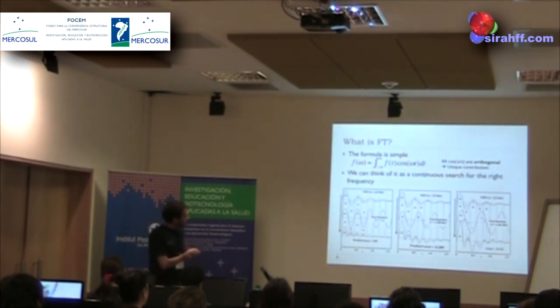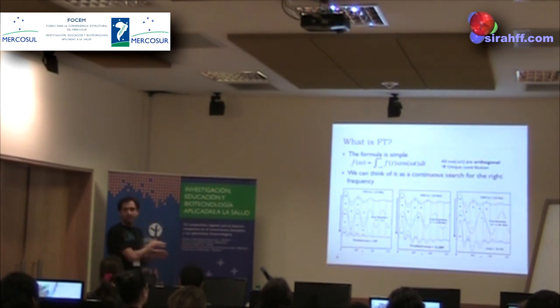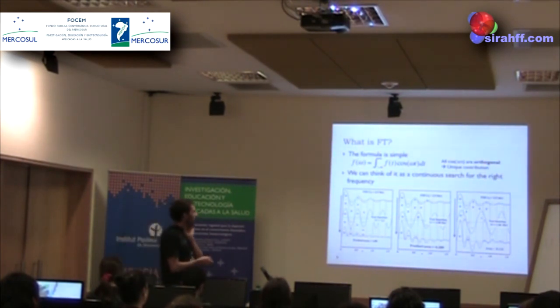The only point where you will get a completely positive product will be when the frequency that you are probing with matches exactly the frequency of your signal, right? So the FT is really simple. You're probing all the signals. This is the way the numerical calculation works, probing every single frequency in your spectrum and seeing whether it's there or not.